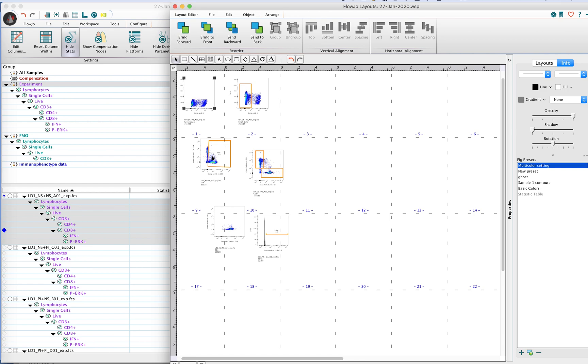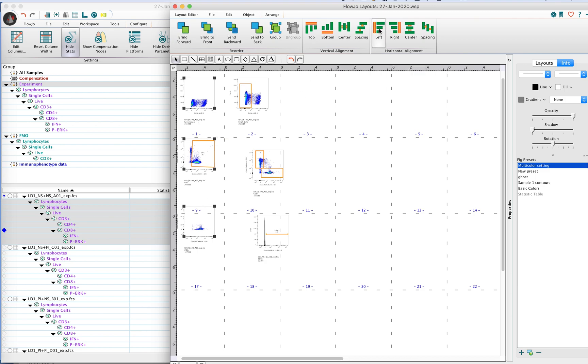Now we have a series of plots here that maybe we want in one column going down. What we're going to do is align left first, and then adjust the vertical spacing so that they're all evenly spaced.